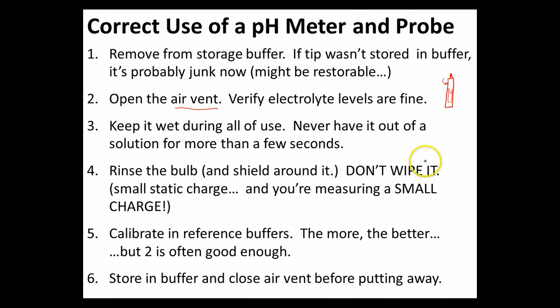The next thing you want to do is always keep the tip sitting at or below the surface of water. You don't ever want to let this thing get dry, because if it gets dry, that layer is going to collapse and we're going to have a problem. You can have it out for a few seconds, but if you're waiting more than 10 or 15 seconds to get a measurement done, put it in something — even if it's just DI water. You don't want it to get dry.